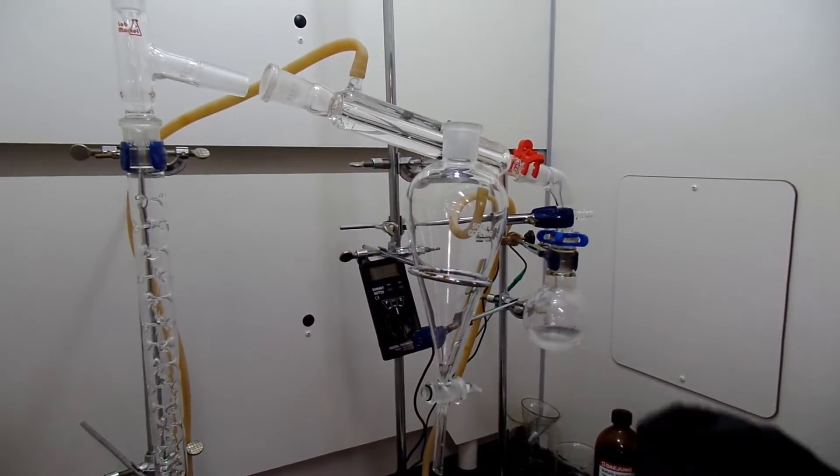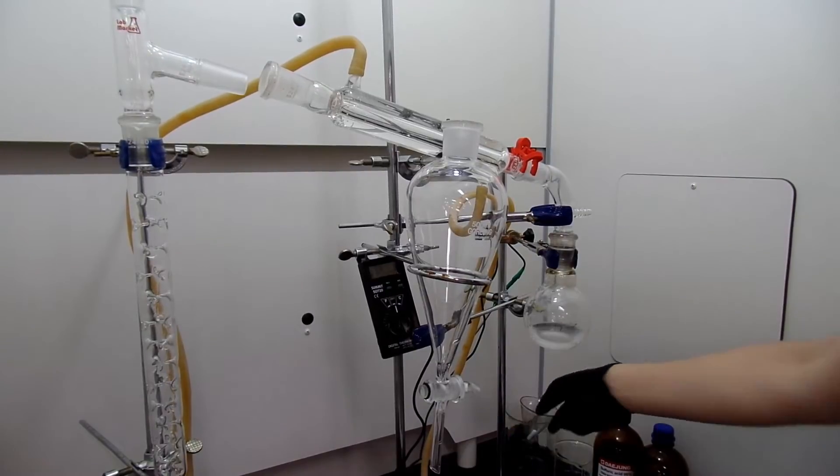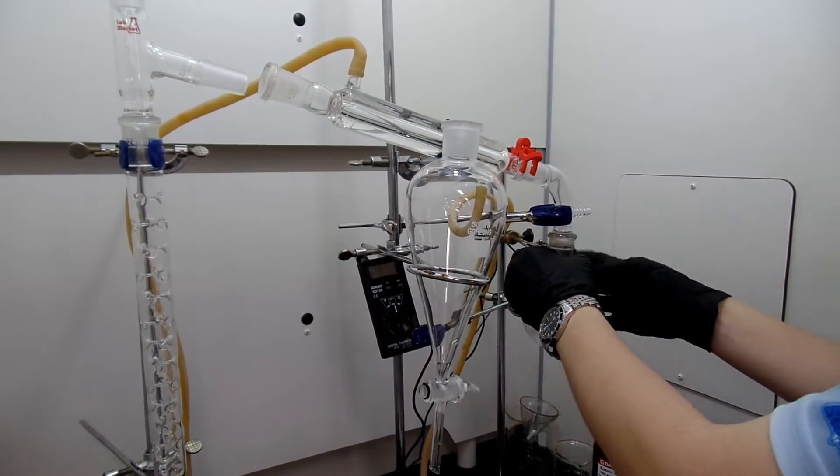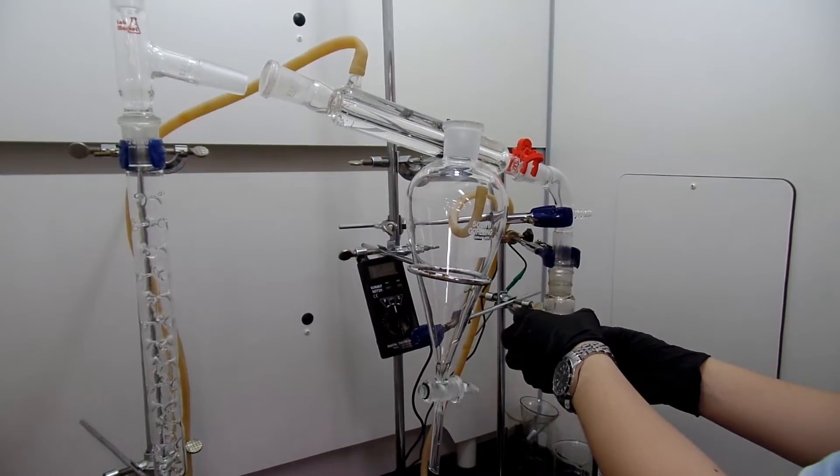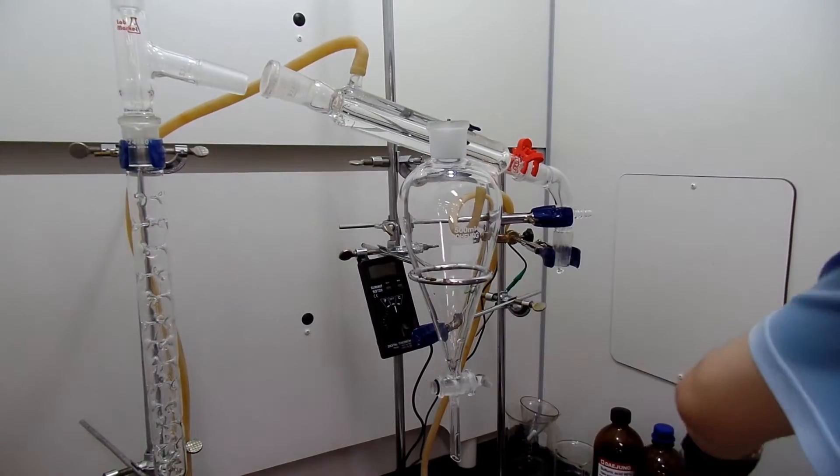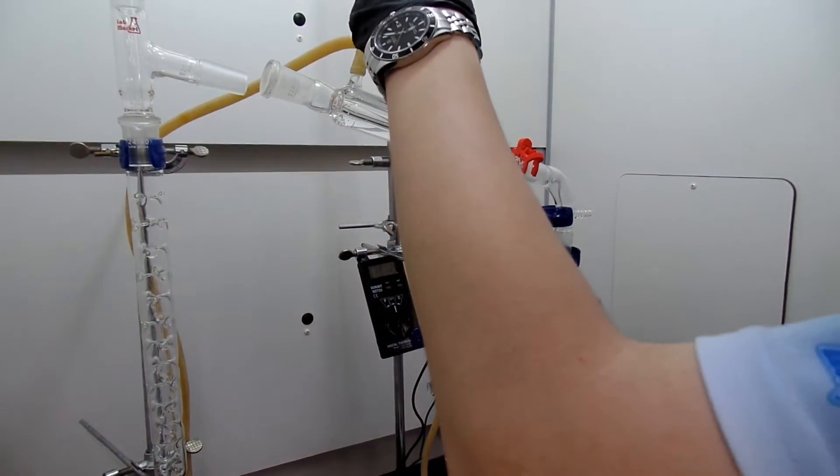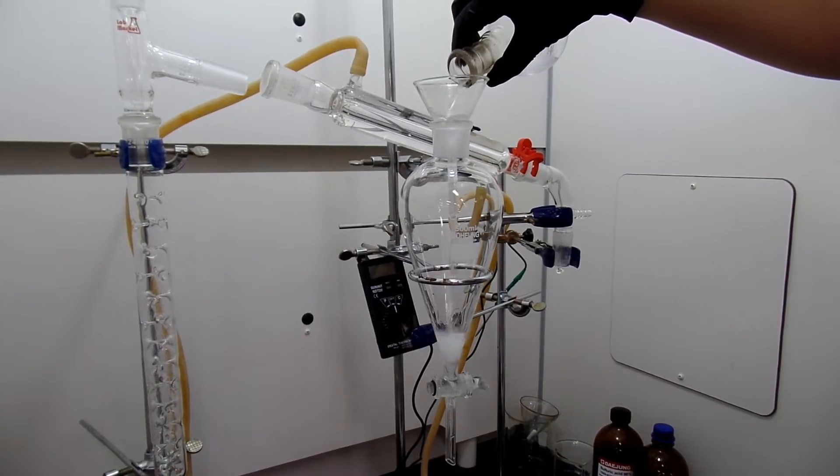The distillate should have two separate layers. The lower layer is our target, one bromopropane. Actually you will smell a lot of ether, and that is dipropyl ether created by the heating of one propanol under strong acidic condition of sulfuric acid. I don't really have to separate this thing because I'm going to use it for Grignard reaction.